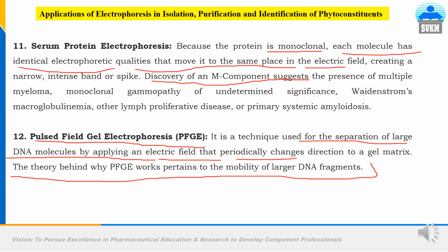Now, dear students, I keep telling you through this presentation that separation of proteins, nucleic acids, and DNA takes place for the plant. So what is the main application of this electrophoresis? It is a complete isolation of the DNA, the protein, and the nucleic acid or amino acid, but also its purification, as well as a complete identification of the specific type of protein present in the plant material or in an isolated compound.